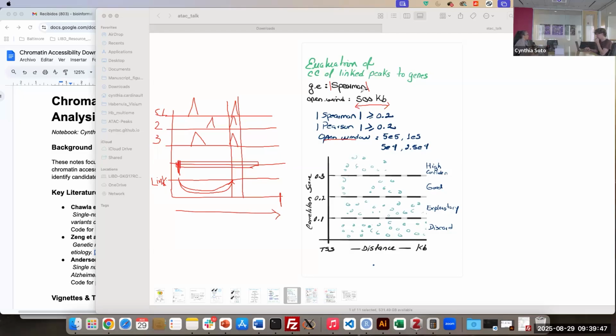So this is a very generous distance indeed. And usually the literature says that we have 3 kinds of scores to measure correlations. The correlations that are under 0.1 usually are discarded peaks. So in order to create this kind of plots, when you really want to define the data that you want to interpret, you need to discard these peaks from here.